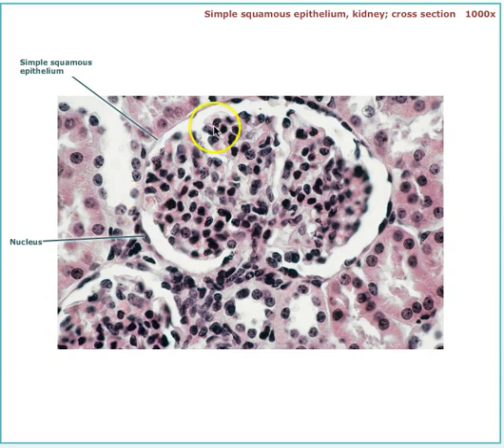Here, you can see even closer the simple squamous. See, it's highlighted here in yellow. Flat cell, flat cell, flat cell, flat cell, going all the way around. And then over here you can see some more of the cuboidal. So cuboidal tends to have the same width as the height, so almost a perfect square. The squamous are going to be the flat scale-like cells. Okay? And this is at 1,000 times magnification.